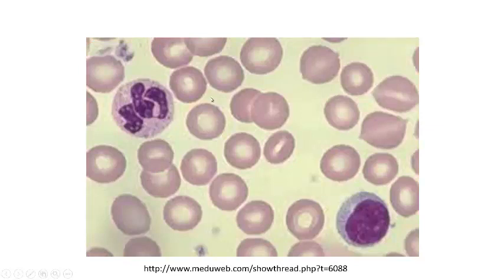Now on this slide the color's not that great, but I see some platelets up here, and here's a platelet down here. Lots of erythrocytes with those pale centers because the hemoglobin is around the edges, and I see a lymphocyte with its nucleus and a little bit of cytoplasm.